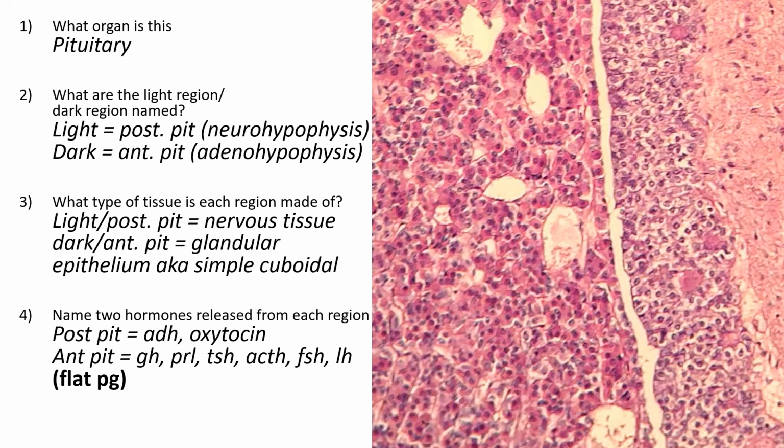Remember, think pale pink posterior. It's pale pink because it is neural tissue. The darker region is darker partly because there are so many nuclei, and because it's mostly cell, there are more organelle type things, and it just stains darker than nervous tissue.